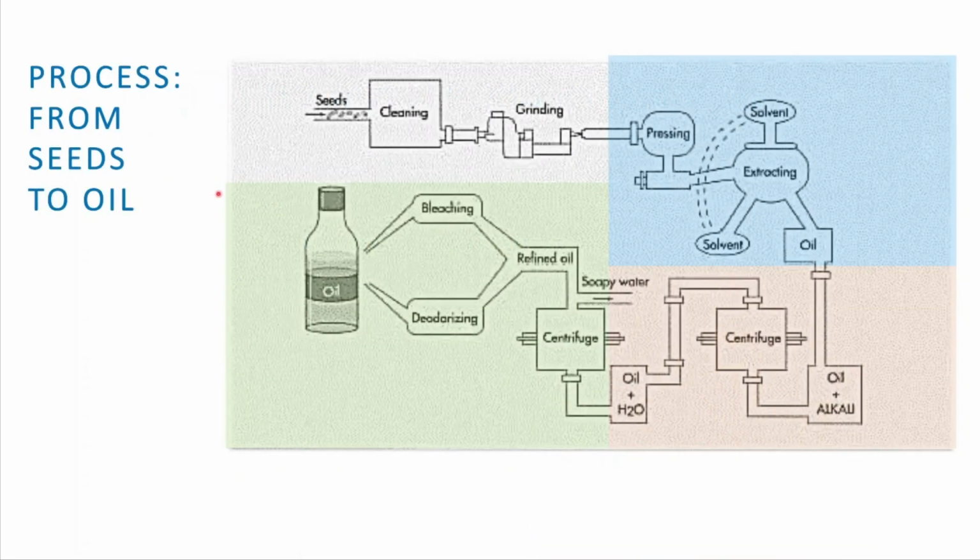In a schematic representation of the production phases of edible oil, the raw material of origin are oil seeds. After pressing and solvent extraction, the result is crude oil. The first stages of refining are centrifugations with a mix of water, caustic soda, and acid corrections. Subsequently, we find the discoloration with clays and the deodorization in the column at high temperatures. So I get refined edible oil.